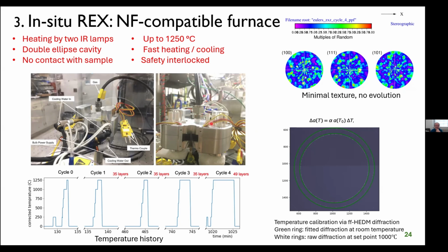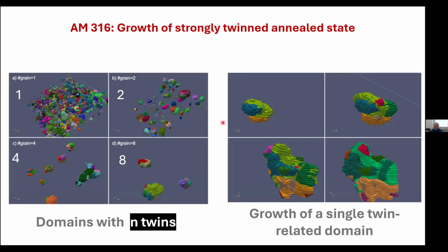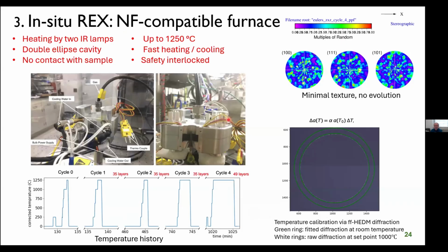It's an infrared furnace that heated the sample while it was on the rotation stage, and it even allowed us to monitor the diffraction patterns as a function of time at elevated temperatures. We did the measurements that led to these images at room temperature, but we could monitor what was going on and stop the annealing at the desired times after a certain amount of development.